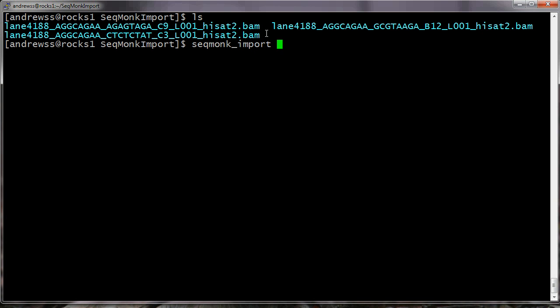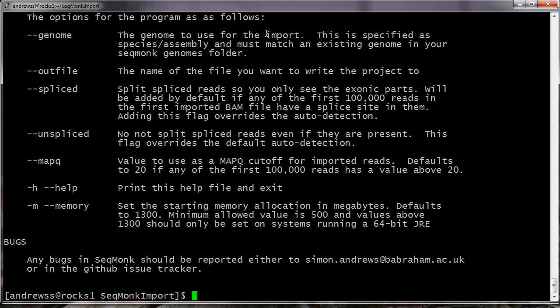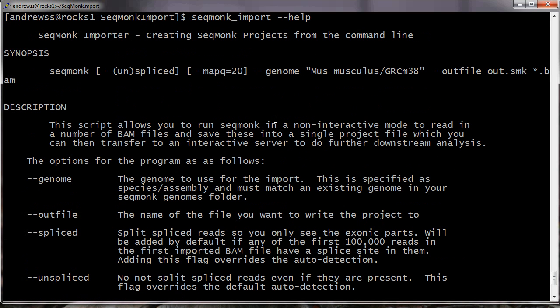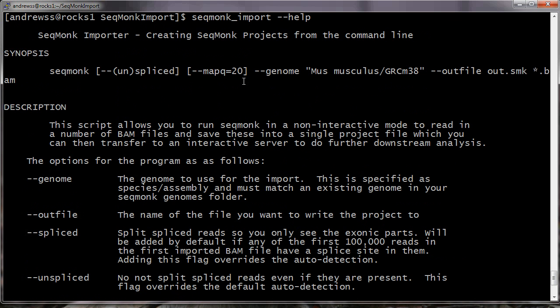So if I just bring up the help file for this. So there are a few options to SeqMonk import. The ones that we have to supply, we have to tell it which genome we want to use as the basis for the project. For this to work, the genome must already be imported into a genomes folder on this machine, so you'll have needed to have run a SeqMonk session for long enough just to do the basic setup and to get the genome imported.